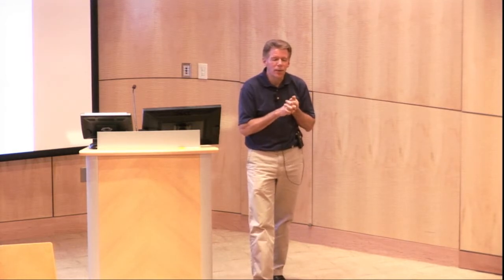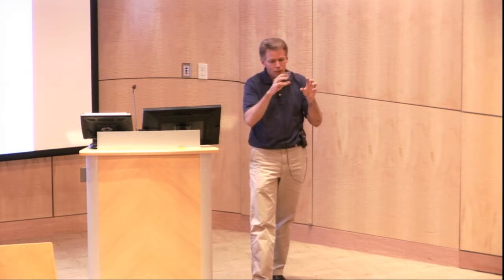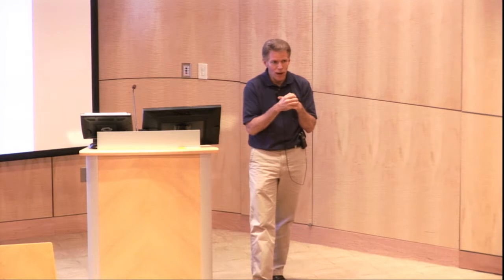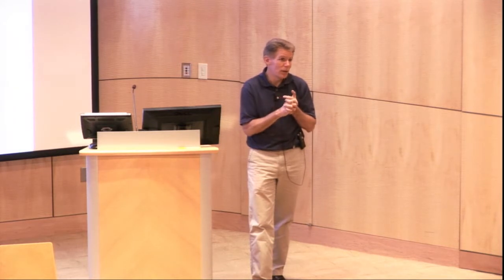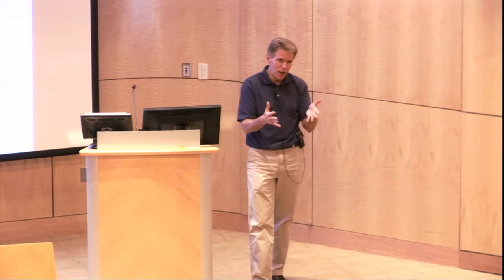There's actually an algorithmic limitation today for performance. If the read depth gets too high, we will punt on a more expensive algorithm that tries to sort through areas of high depth and find signal even though there's a lot of noise in that area. And we punt today if the read depth gets too high. Our belief before was that a lot of those regions wouldn't have real deletions, but it turns out that a fair number of them do. So we're going to work on the scalability of that algorithm.